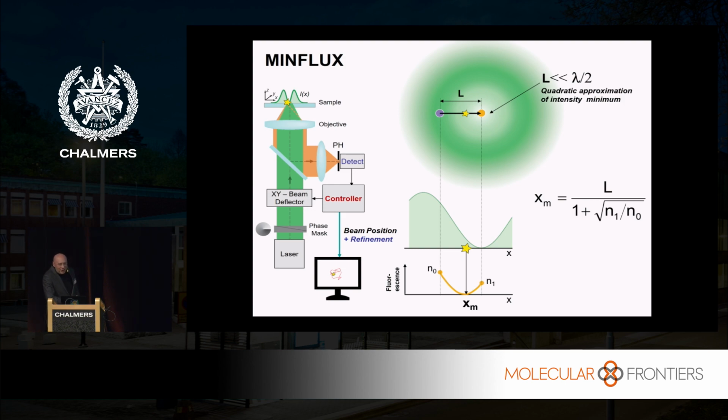Now, this simple equation is actually surprisingly profound, because one thing it's telling you is that there's no wavelength dependence. Gone. There's no wavelength in here. You just find it out by ratioing the brightness of the measurement at the two endpoints. And not only that, there's no dependence on the molecular rotation.